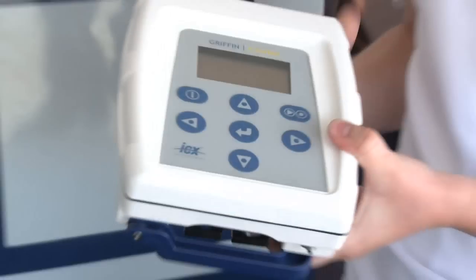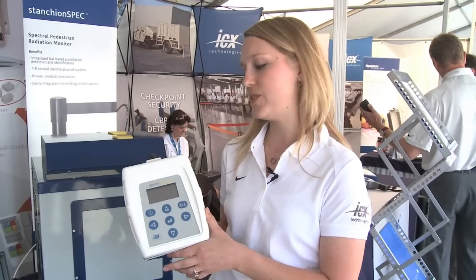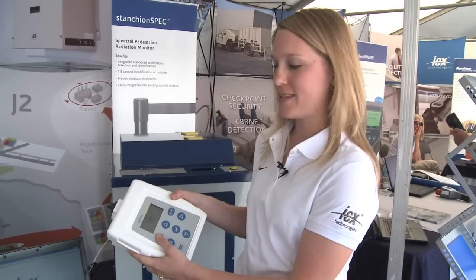The Xorber can also take GPS coordinates and time. You can sample based on volume, time, or manual. Today we're just going to do a volume-based sample. I'm going to press power and it's going to start up, tune itself automatically, and be ready in a few seconds.